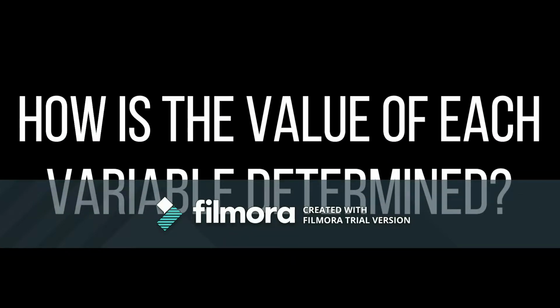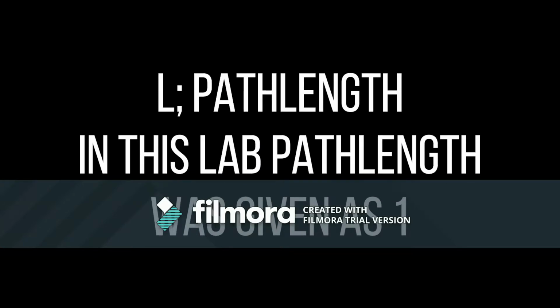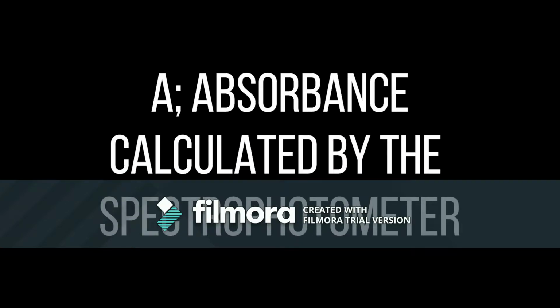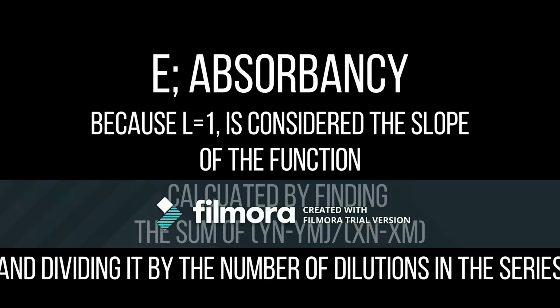How is the value of each variable determined? Path length in this lab was given as 1. For concentration, use this formula. Absorbance is calculated by the spectrophotometer. Absorbance over C, because L is 1, is considered the slope of the function and is calculated with this handy trick.